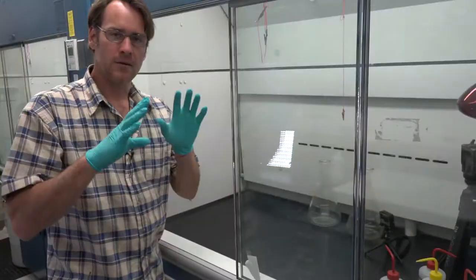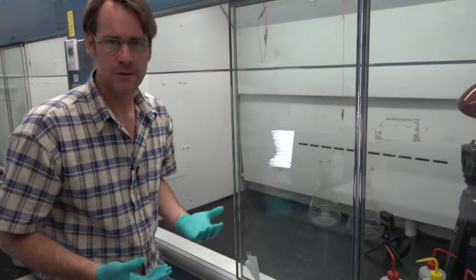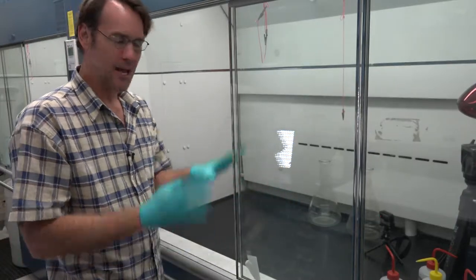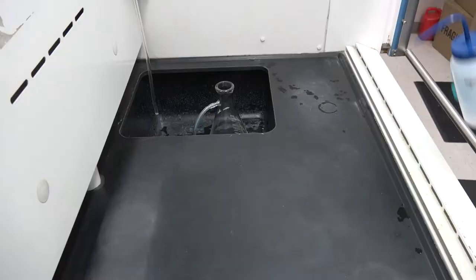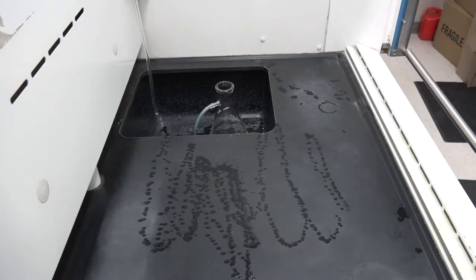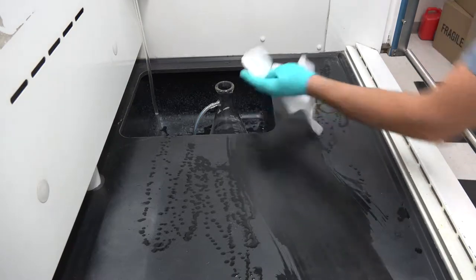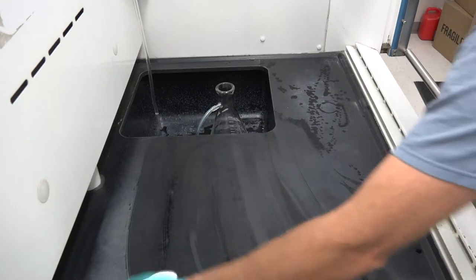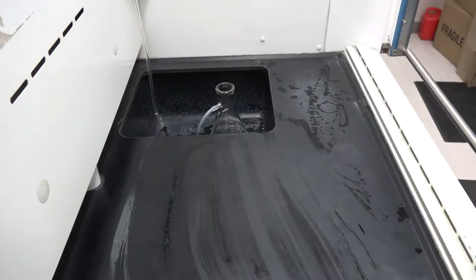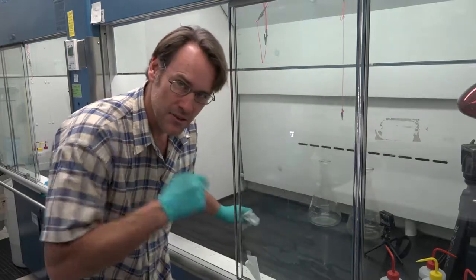Counter's done, time for the fume hood. My own personal rule is since we're training students sometimes people can get sloppy if they're just learning this — I don't touch anything inside this fume hood unless I'm wearing gloves. Using either alcohol or soapy water, wash the fume hood, scrub everything off into the sink so there are no grains left on the counter.